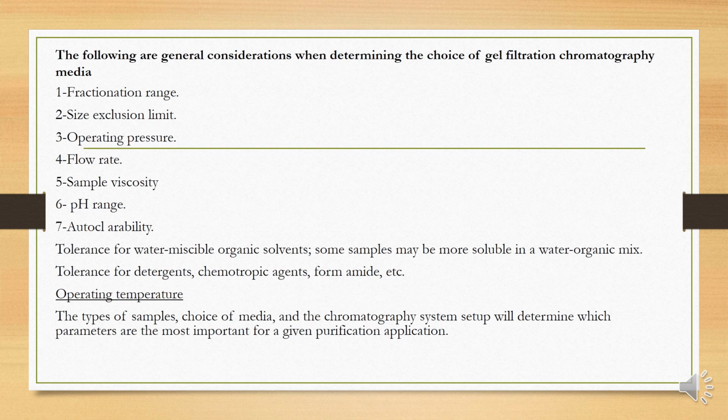Tolerance of water-miscible organic solvents, as some samples may be more soluble in water-organic mixtures. Tolerance for detergents and chaotropic agents.